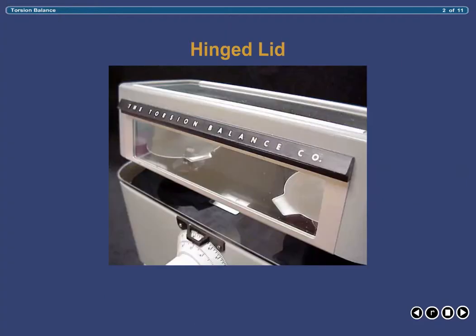The first component of the balance to introduce is the lid. The lid spans the entire length of the balance and has clear glass across the front and top, allowing you to visualize the product, the scale, and the indicator during the weighing process. The lid is hinged on the back of the balance for easy opening and closing. To prevent inaccuracy and errors due to oscillations in the air, it is imperative that the lid always be closed during the weighing process.